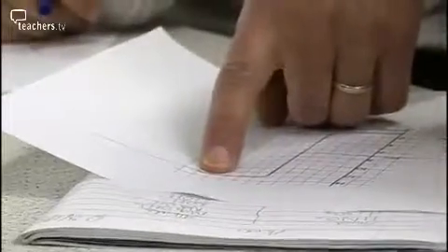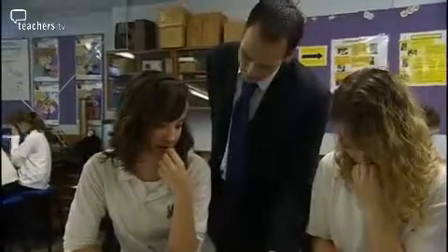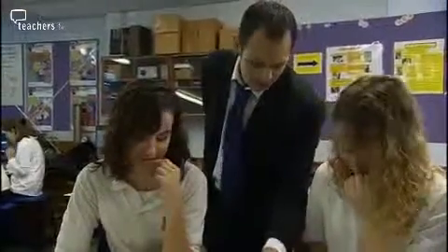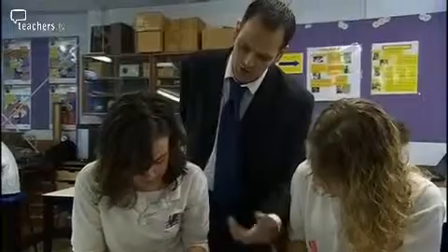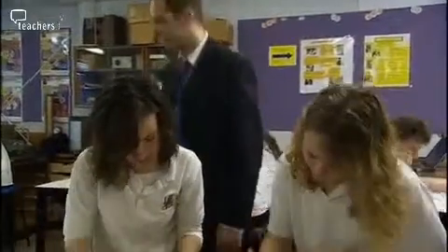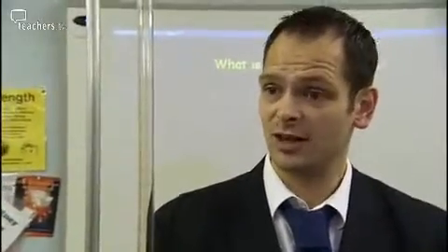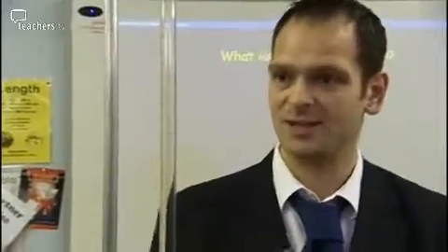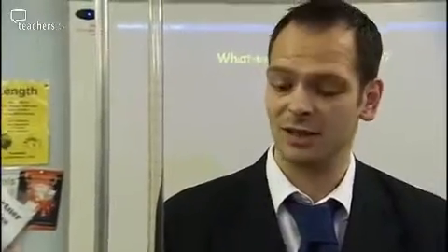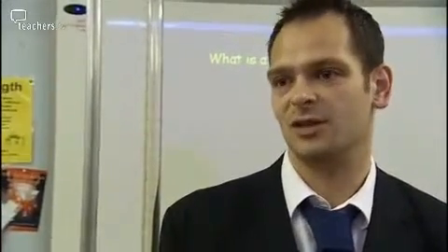So therefore, what's happening here then? They've become like the OHs. There's no H plus left. Brilliant. Absolutely right. There's no H pluses left, so all you've got now is an excess of OH minuses, which means it's now alkaline. All this is about is, can we predict what's going to happen? Can you justify in terms of the H plus ions and the OH minus ions what is actually happening? And the graph gives you the evidence, and it's the kind of instantaneous evidence, and that's the beauty of it.